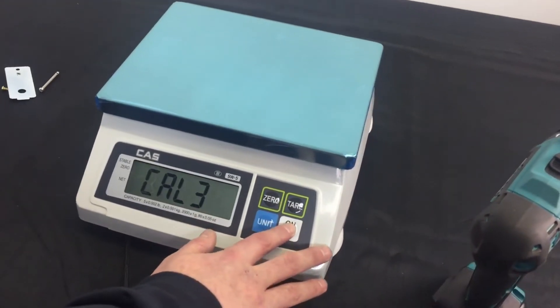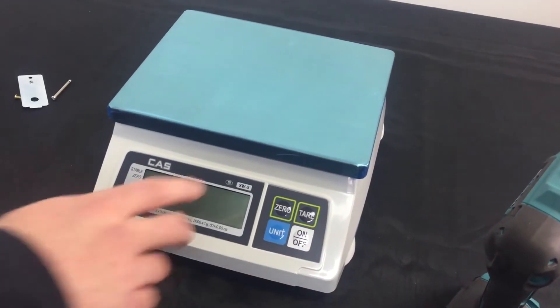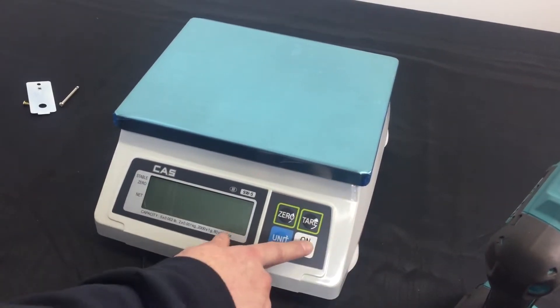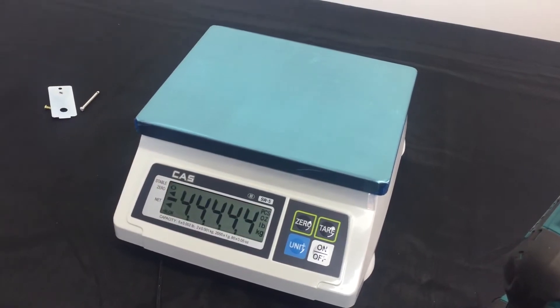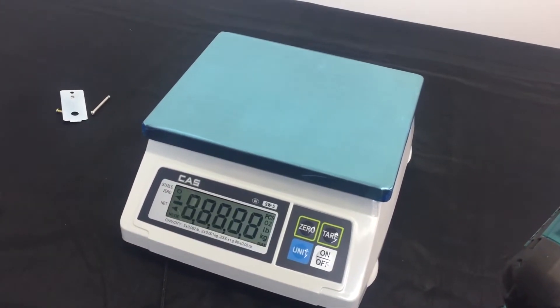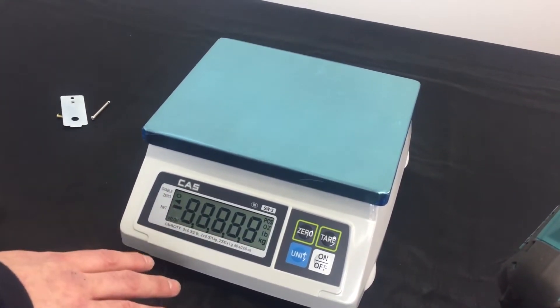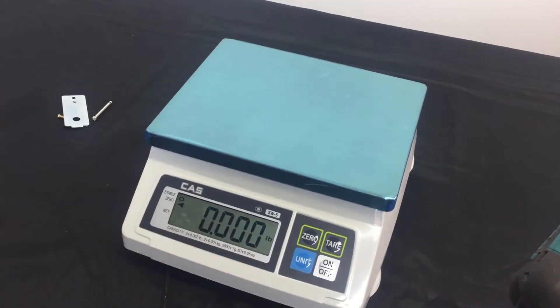Now, all you want to do is push the power key off, turn the scale off. Now, to test your weight, just turn the scale simply back on. Wait for it to count up. Once we get to stable at zero, test your weight.